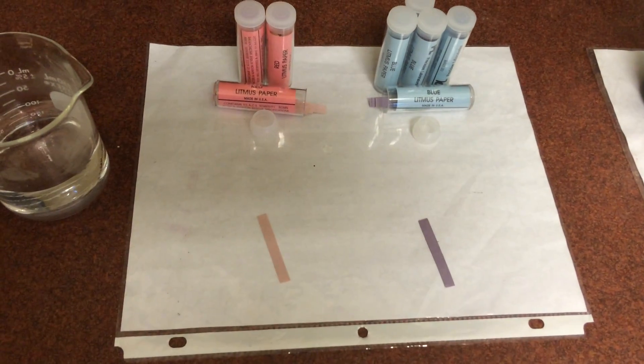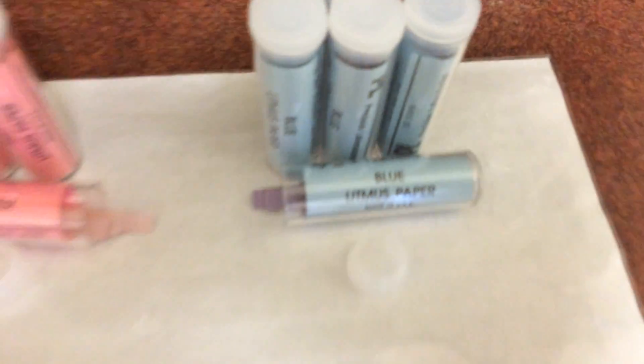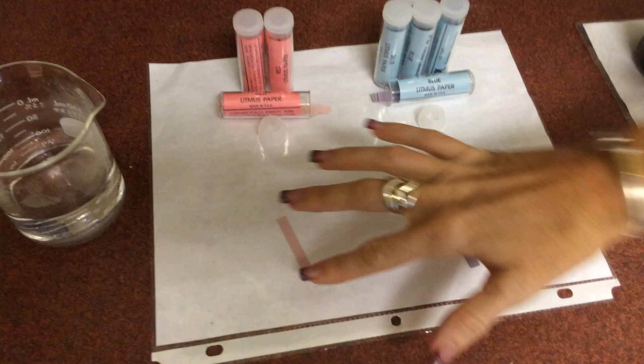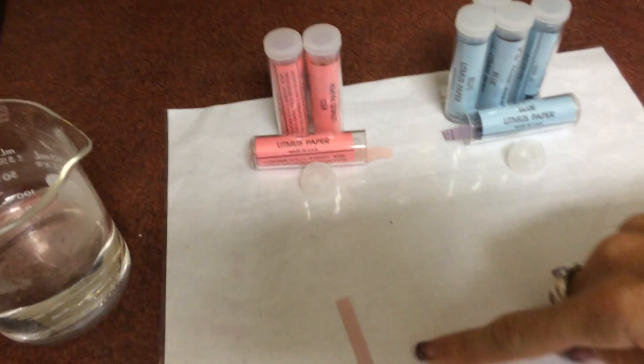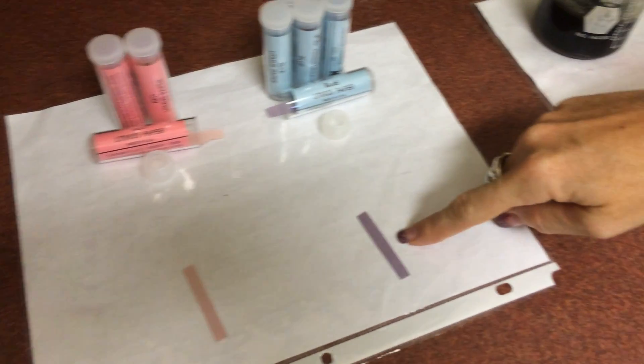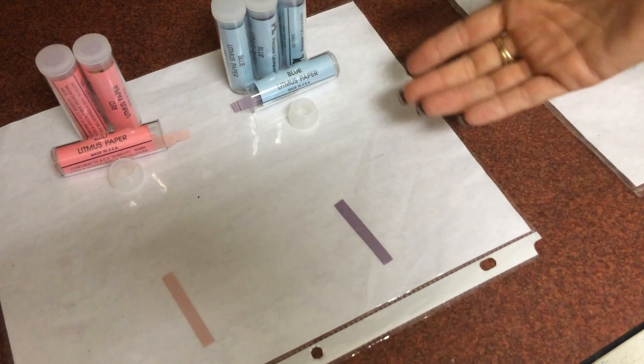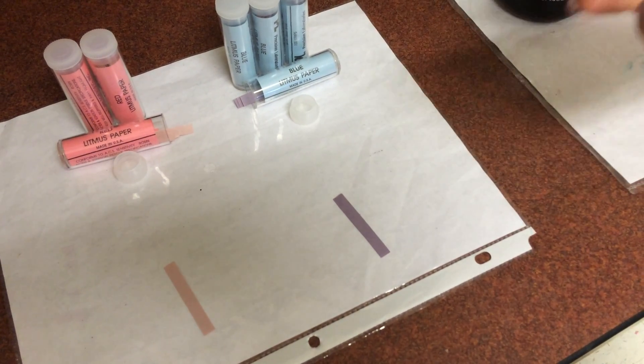Today we have some litmus paper - there is red and there is blue litmus paper. The red kind of appears more pink than red, but the idea is that if we put red litmus paper in an acid it will turn red, and if we put it in a base it will turn blue. We put blue litmus paper in an acid it will turn red, and if we put blue in a base it will stay or turn a darker blue.